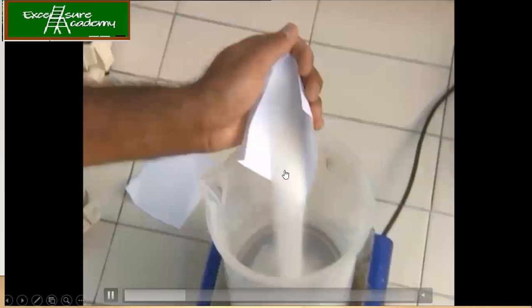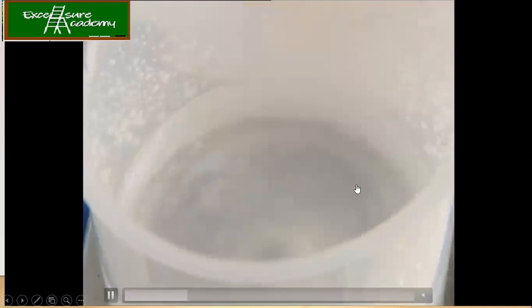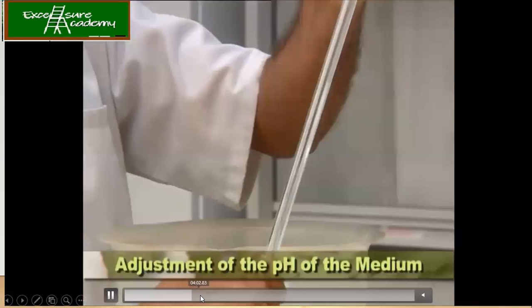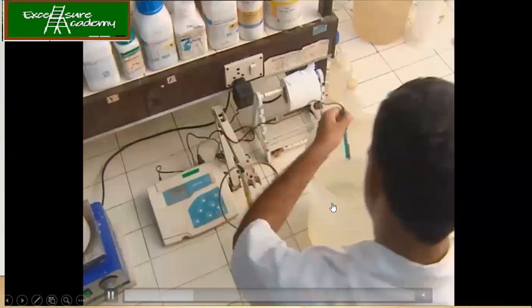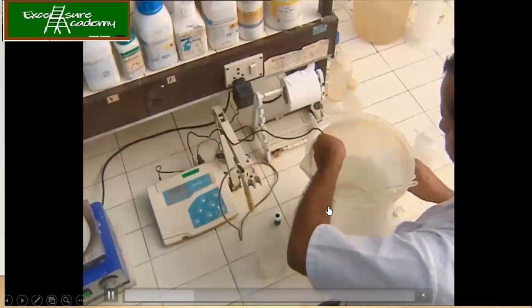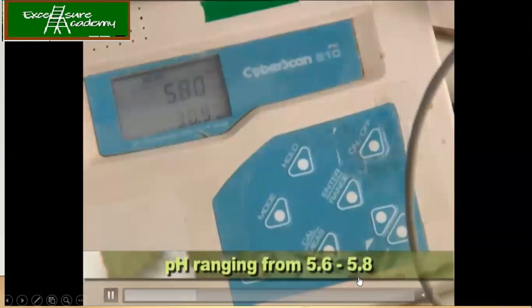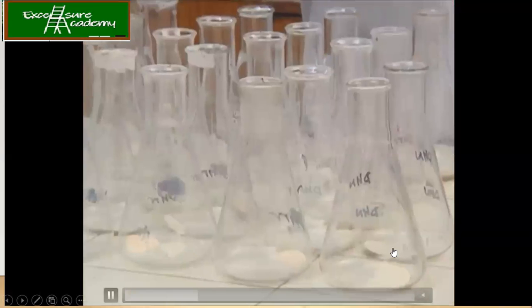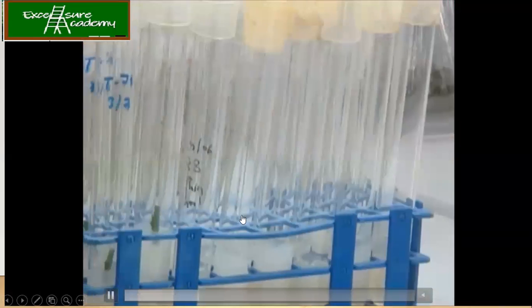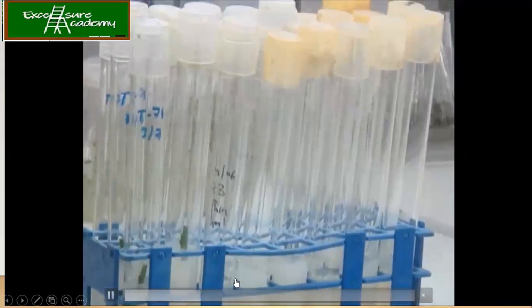Either you can do it on the paper, or you can have a plastic container. Whenever you're adding, just keep the double distilled water on stirring so that it immediately gets dissolved. Then, of course, before autoclaving, you need to adjust the pH of the media, as discussed in the earlier lecture. You have to adjust the pH to around 5.6 to 5.8 or 6, as we just discussed. You can use HCl and NaOH in order to adjust the pH. These are the conical flasks which you're going to need later. So wash them, dry them, and then sterilize them using the autoclave.